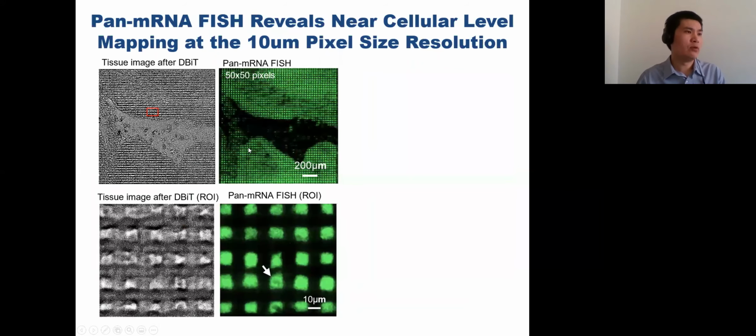And here's another picture we show, at 10 micron resolution. Basically you can see very clear and clean square arrays here. And you can also see the squares because the walls press down the tissue nearby, kind of sealing the square.